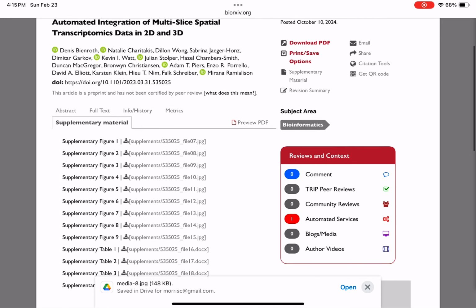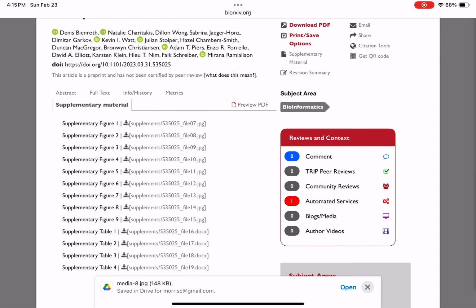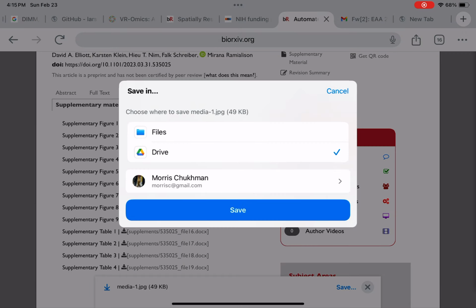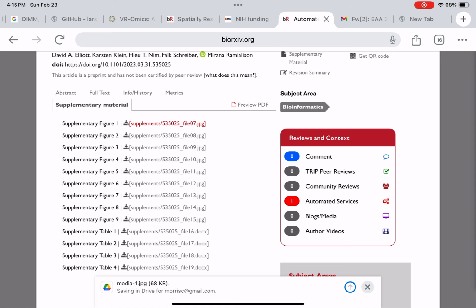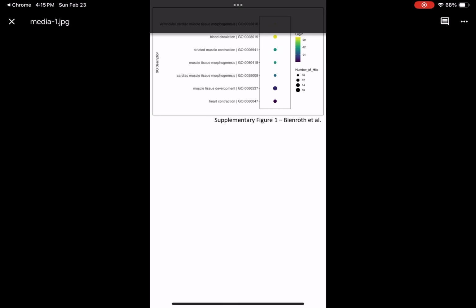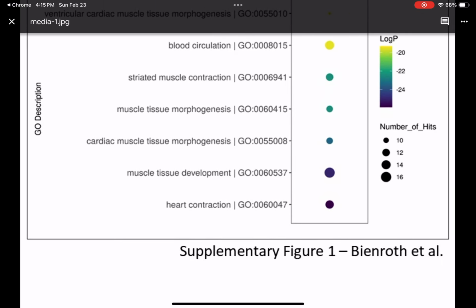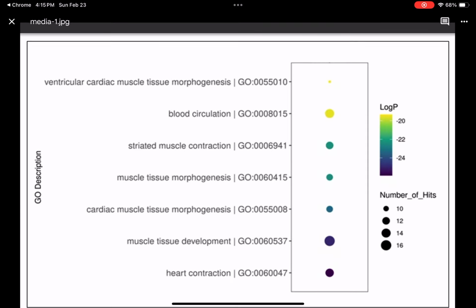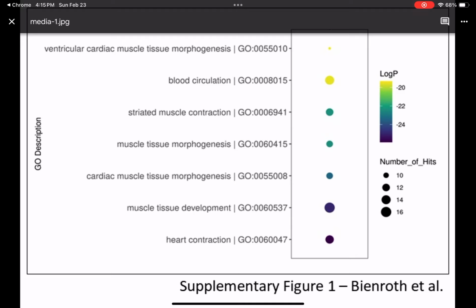Additional results for cross-platform comparisons of mouse brain slides across multiple ST platforms are available. More information on multi-slice 3D data analysis using VR-Omics and orthogonal validation of upregulated pathways in CRMS is also provided. Supplementary methods. Additional information about the input data for ST platforms, the technical specifications of VR-Omics and its corresponding AW implementation, and the features of VR-Omics is provided. Furthermore, there is additional information on the analysis of CRMS using BayesSpace.